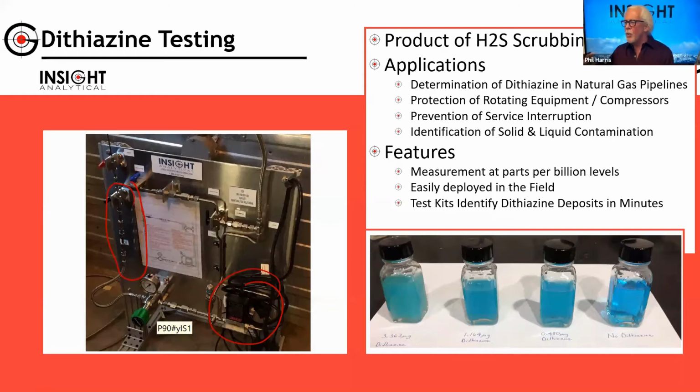The other thing people want to know is, I know I've got this particulate at my compressor station or at a filter, but is it dithiazine? If you ever watch the crime shows on TV where the police put a sample in a liquid vessel and go, oh, that's cocaine or that's this drug, we came up with a chemical that we can use as a similar sort of reaction.